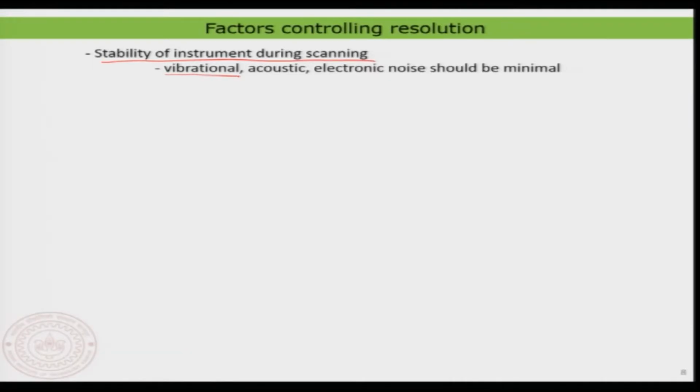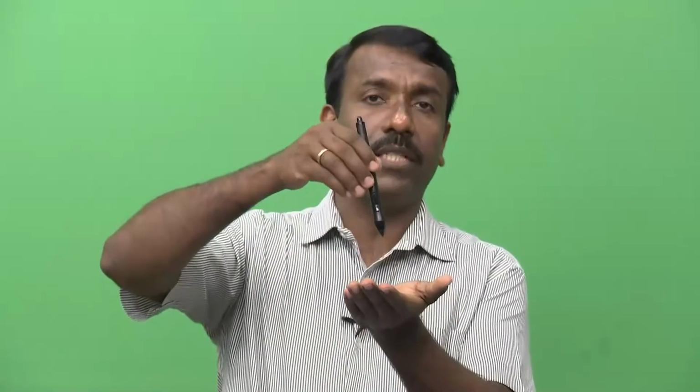So, how do you do that? You need to cut all the vibrations, because if the microscope is sitting somewhere, there are vibrations that happen around it. For example, you cannot walk around the microscope. This is something very interesting, because if you walk around, you would excite the floor, and that excitation can couple to the microscope, and then the microscope would also start to vibrate. That means eventually the tip will vibrate.